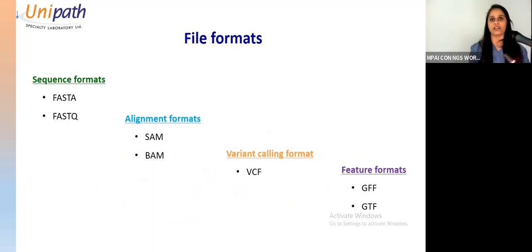Now, we talked about the FASTQ we get after demultiplexing, right? So you have a FASTQ file. Previously, in most of the sequencers, like Roche and all, you used to get a FASTA file, but now we have FASTQ files. Once you have a FASTQ file with you, we filter it to remove the adapter and low quality sequence. After that, we take the reference genome and map on it. That is the basic step of all the analysis. As we have a reference, we map on it, right?